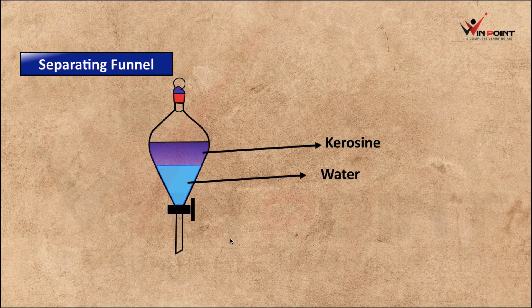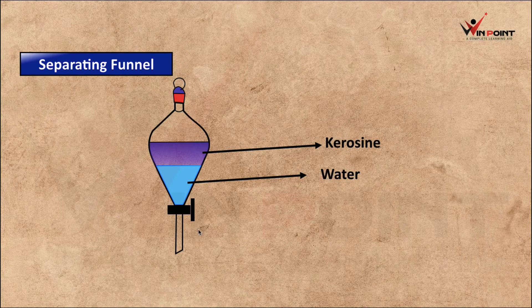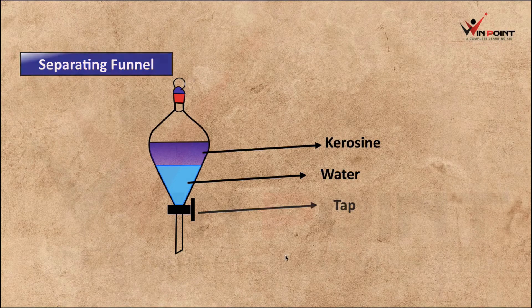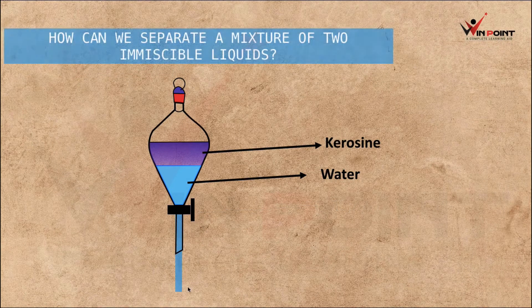How can we separate it? Now we are going to separate it by opening this tap. When we open this tap, water is at the bottom and it is going to come out. Now the tap is on and the water is coming out.